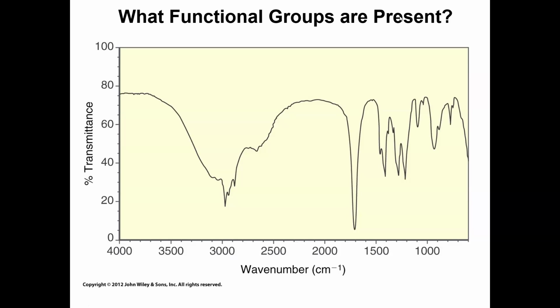Okay, so I'm getting some answers at 3000 carboxylic acid, correct. I got another answer. It says ester and carbonyl. There's definitely a carbonyl for sure. Is it an ester? I'm not exactly sure.